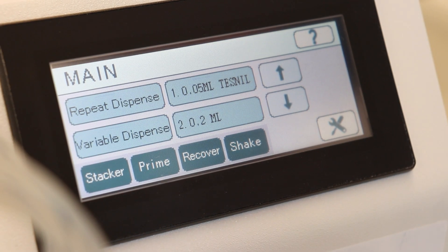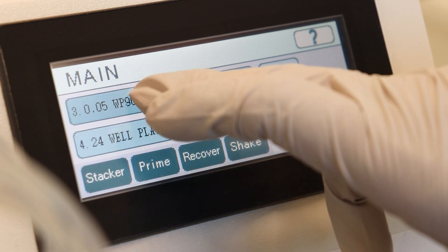After the wash, equilibrate the plate based on the target molecule and plate chemistry.